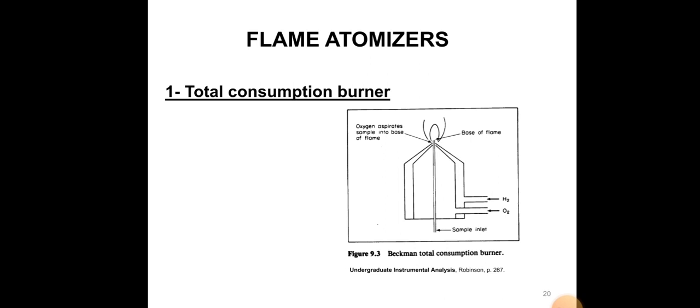So this burner is not a good burner, because all the droplets of the sample, I mean the small and big droplets, will directly enter the flame, and some of the droplets will not be atomized because they are big droplets, and this will decrease the sensitivity.